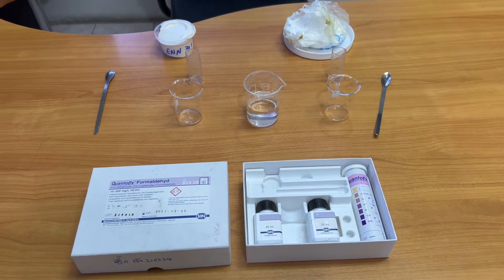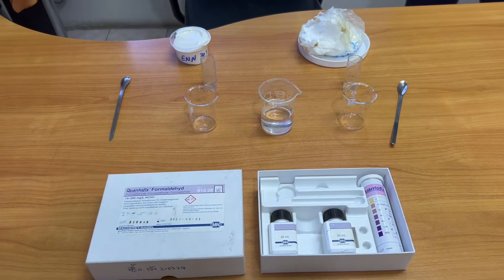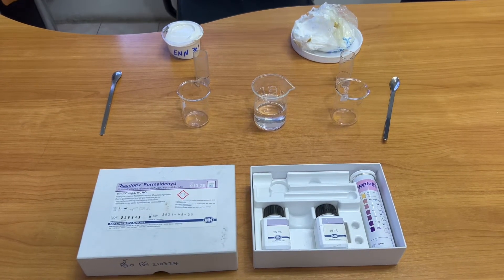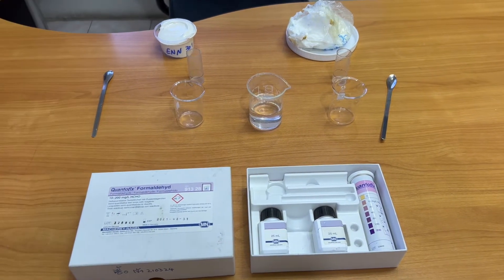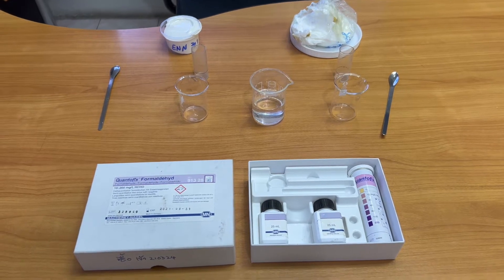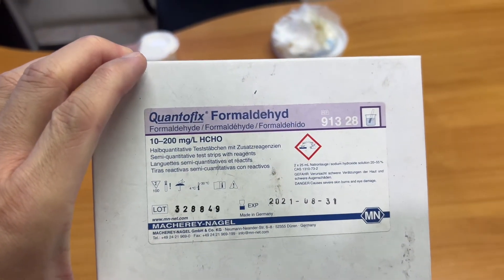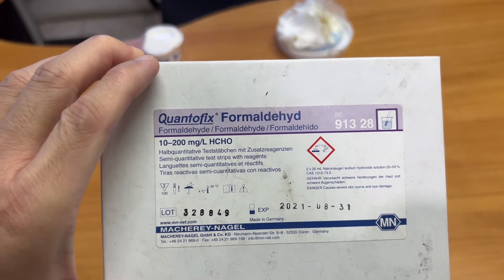Right now we are going to test the formaldehyde content with two samples. On the right side is the sample that came from you, and on the left side is our rubber clear sample ENN301. We are going to use this QuantoFix formaldehyde test kit to test these two products.